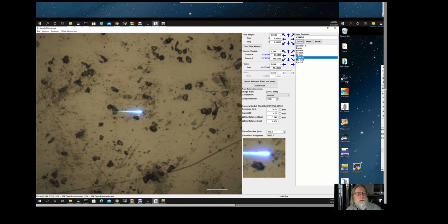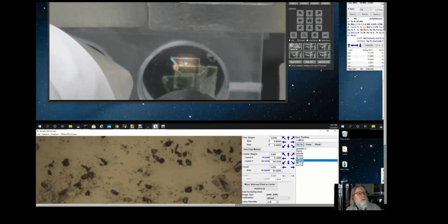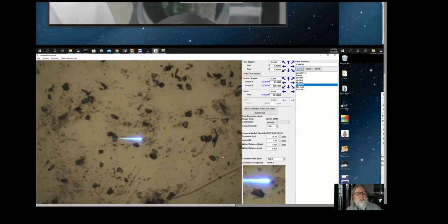So you can see the beam position isn't perfect. It's close to that circle, but not perfect. And the beam here in this view looks much longer than it is tall. That's because the sample is sitting at 45 degrees to the incident beam, with the right side being closer than the left side. So the X-ray beam comes in at 45 degrees, hits the cadmium tungstate about in this position, and then penetrates deeply into the cadmium tungstate at 20 keV, and that optical light coming from that absorption deep into the sample gives this tail off to the right.